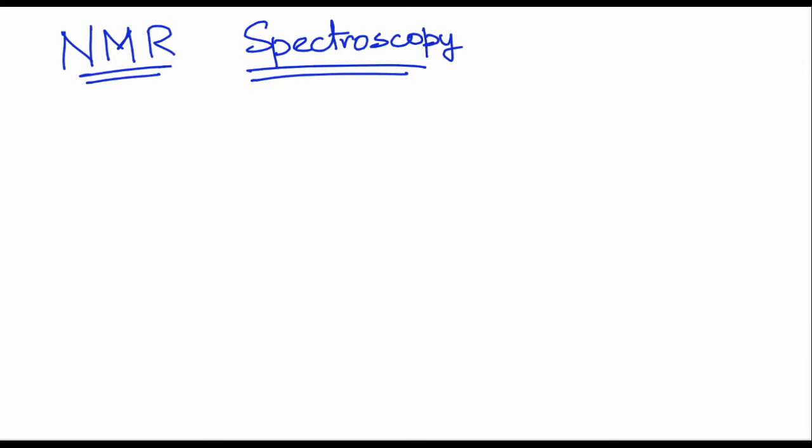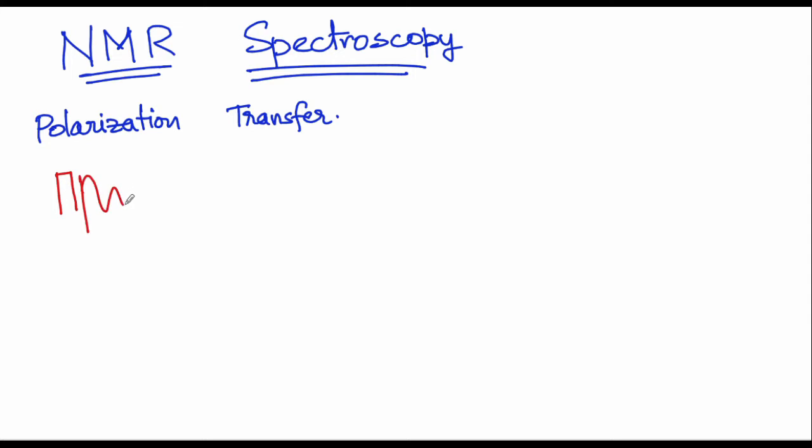In this lecture, we will be looking at an important aspect of NMR spectroscopy. You will be introduced to a concept called polarization transfer. I'd like to recollect some of the aspects that we have learned so far.